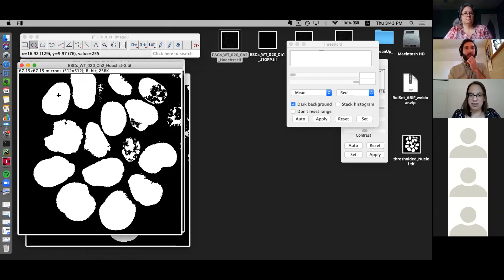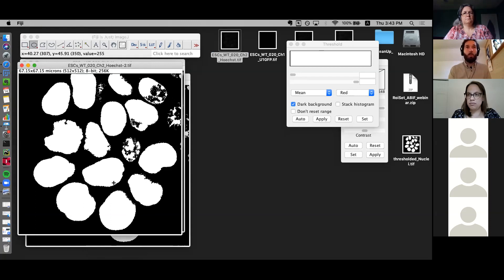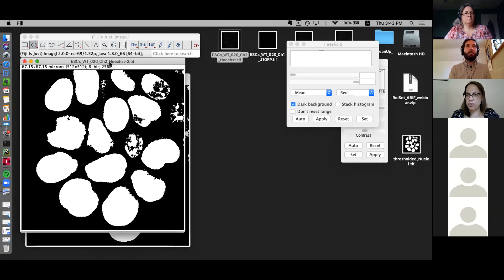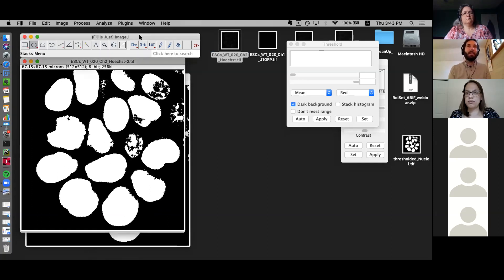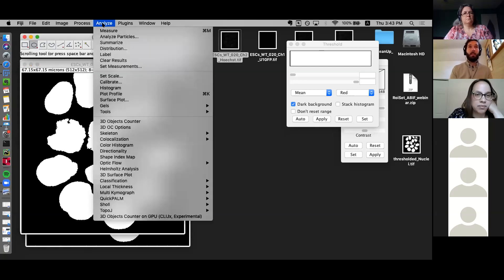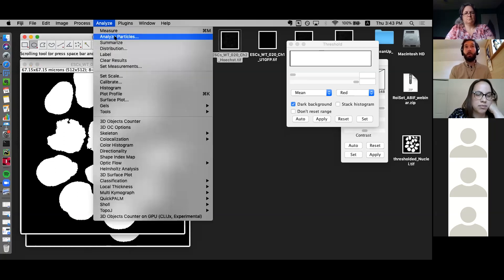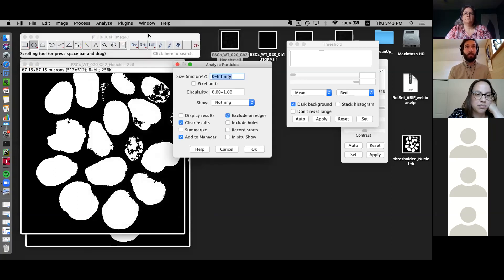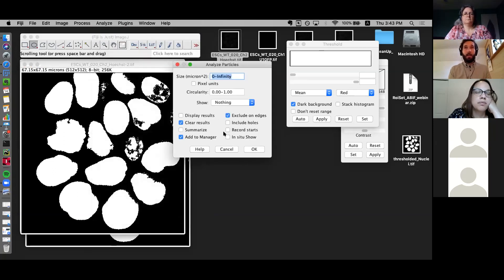Now that we have these nice continuous areas of our nuclei, we want to essentially get the geometrical shape — the coordinates of the edges — to apply them onto another image, such as an image taken in a different channel. There are many ways to do this. The simplest way using native Fiji functions would be Analyze, then Analyze Particles.